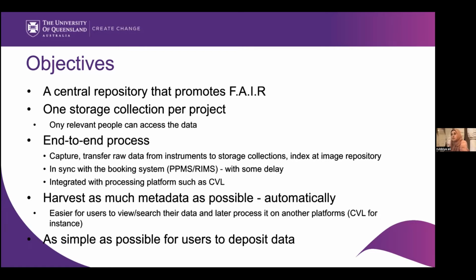Then the purpose was that, once the data is stored in the collection and indexed, it should be able to be processed using some platforms such as CVL at UQ. The challenging thing was, the data was stored at different locations, but there were no records of metadata. What researchers were doing was putting the metadata details in their lab books, and when you need to find the exact thing you are looking for, it takes so much time.